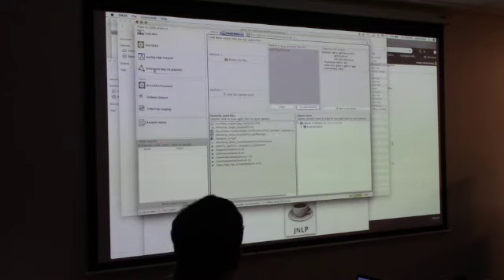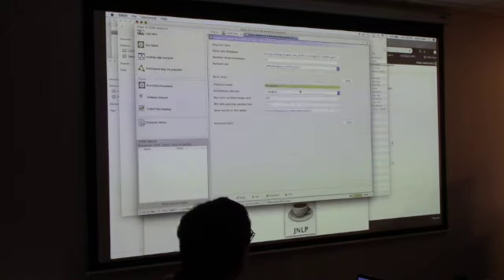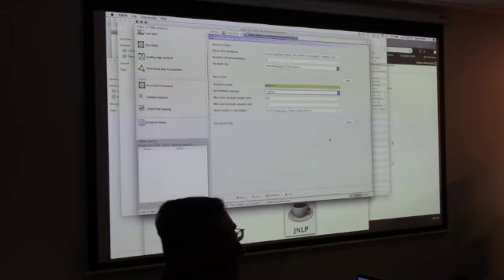All right. So now when we go back to run GSEA Preranked, we are ready to run. We can look at your basic fields. Now here is whatever. And then you select classic here instead of weighted, right? The reason for that is because we're using GSEA Preranked. This is a parameter that always has to be classic. It cannot be weighted. Okay?